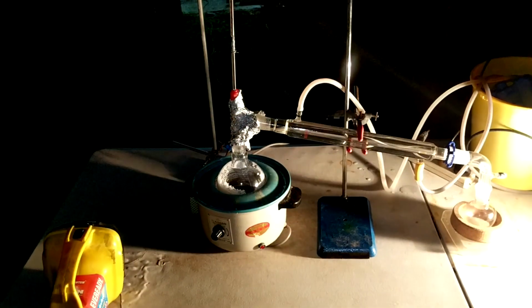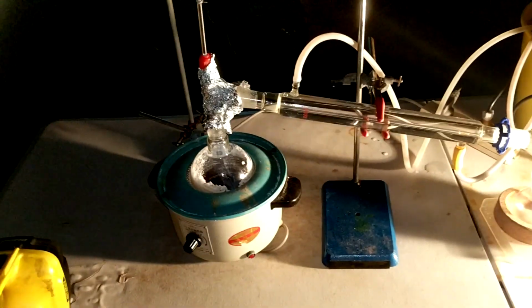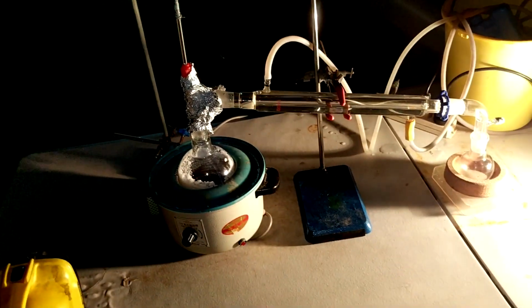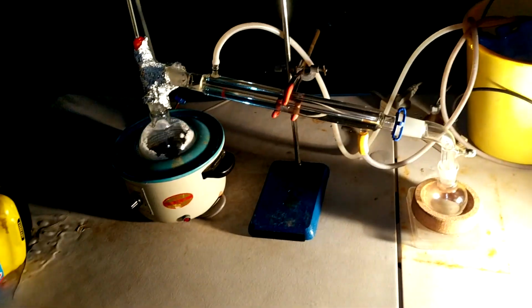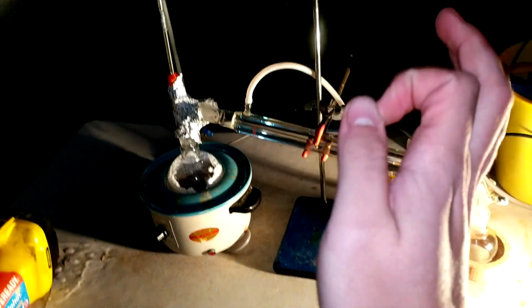Alright, good news. I can tell it's working because all of a sudden it started to just reek. We've got a little bit of liquid over it. You can see it's heavily contaminated, but like I said, we're doing another distillation. We should be alright. Thick, fishy aroma to it that you just, it's not a very chemical smell. It's a real rotten food kind of smell. It's real bad. But once again, it's the smell of success.